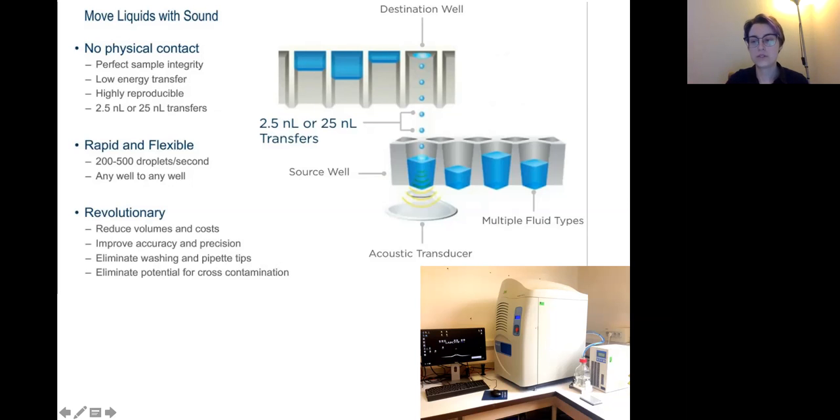In our case, I'm gonna talk mostly about the OpenTrons in this video because I was told that you have one in the space. And so hopefully, if you never used it, this can help you to think about what the logic behind the programming in the OpenTrons is. And if you have already some training in programming, it's gonna be very easy, but also if you don't, if you're just a biologist, it's not so complicated once you get into the logic.